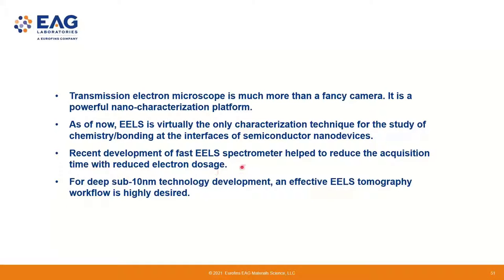I think one final comment about the EELS technique these days is that, as I mentioned earlier, with the dual EELS mode, you can open up the 5,000 eV range, right? But if you go to the quantification mode, you will find many of the high energy signals don't have a reliable cross section model, right? So if you want to, for example, quantify with a higher energy, you don't have the cross section model yet for the quantification. So I think this is probably some homework for our Gatan colleague to figure out, to maybe patch the software.